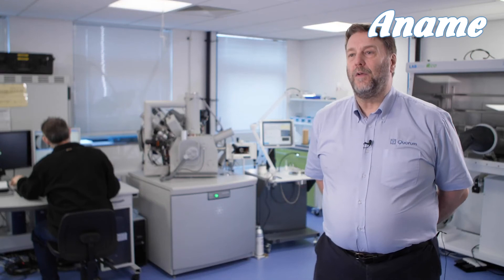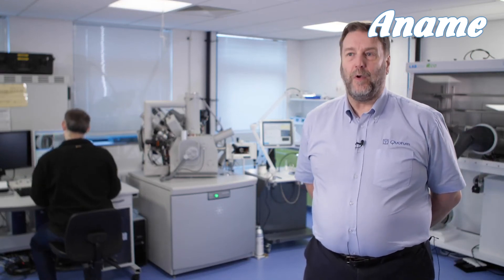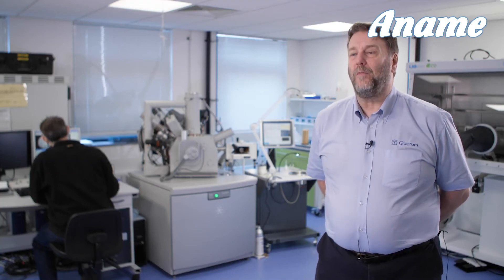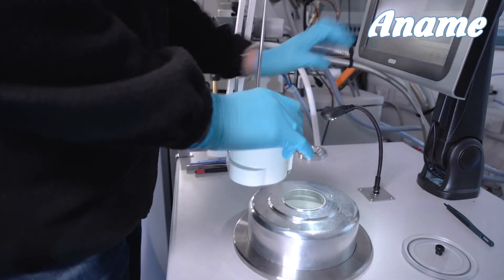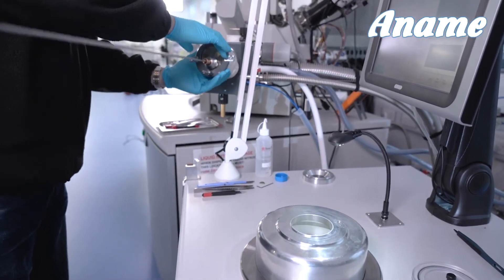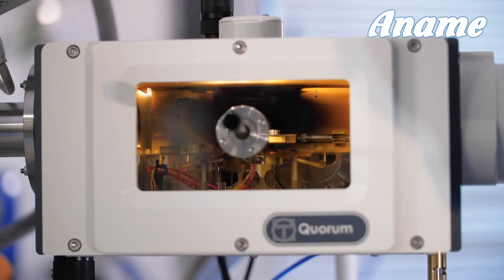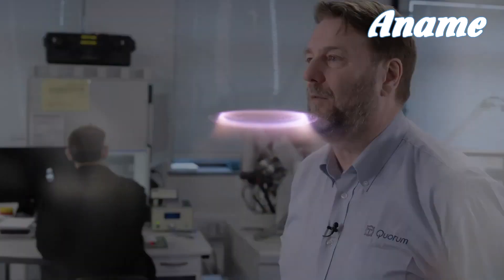Because the system is controlled by the touchscreen PC, the automated startup process guides the user through every single step until they are ready to make a sample — it will pump the system down and run the cooling to the set temperatures. When the user selects auto startup they are guided through each step including pump down and cool down, and when the system-ready sign comes up they are ready to make their first sample. During sample preparation, sublimation and sputter coating or carbon coating is controlled by recipes and is fully automated, making it very quick and easy to use the same process time after time, or to recall those processes a year later and do exactly the same preparation.